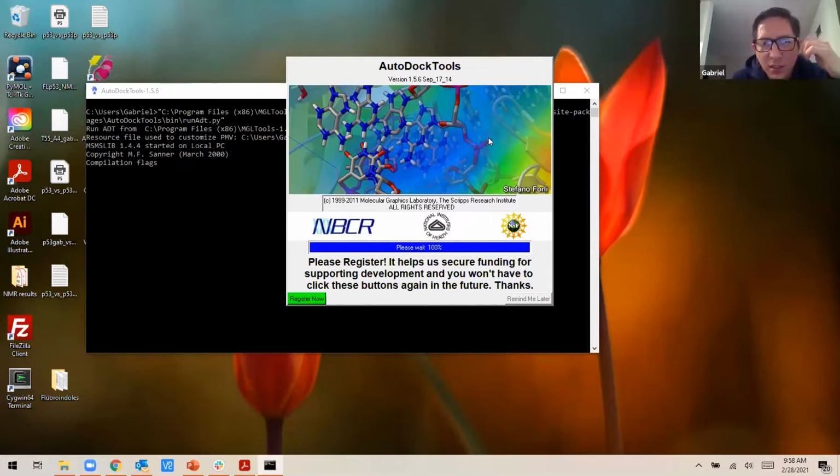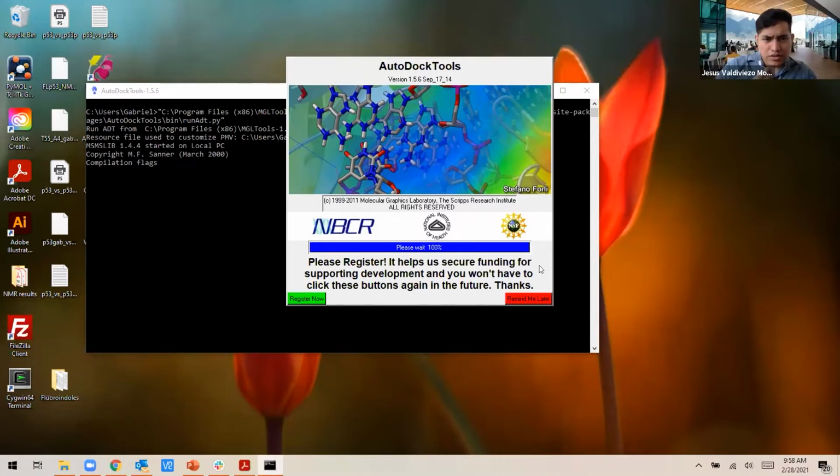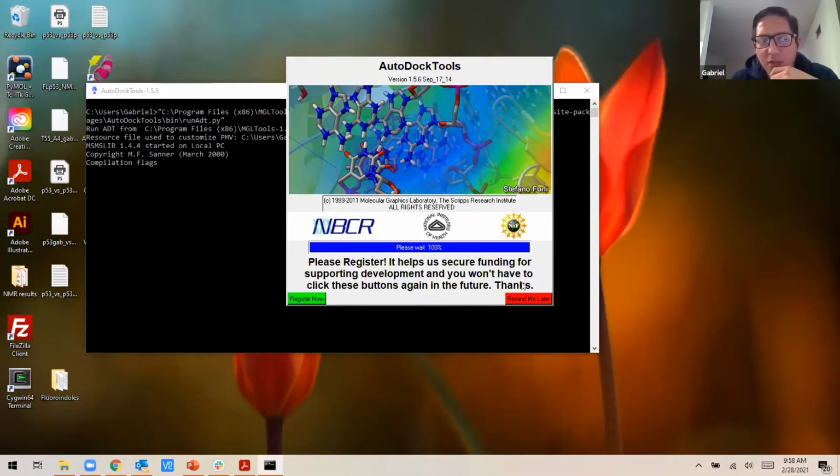I cannot see the chat. So, there was a question if you should pick PDB format experimental or PDB format ideal coordinates. Ideal coordinates. Thank you. So we opened this and it's not going to launch immediately, but you have to say remind me later. So you click there. Don't register now. You can do that later, right?